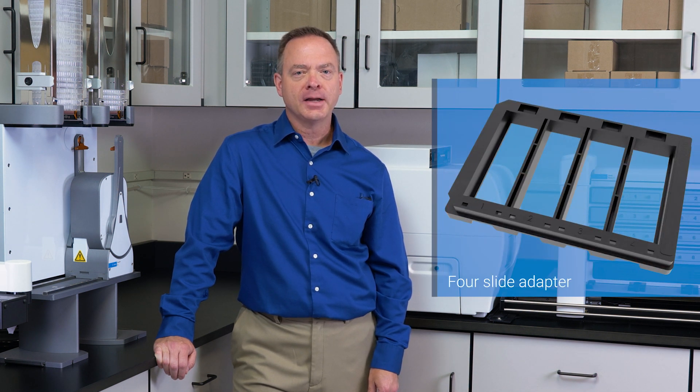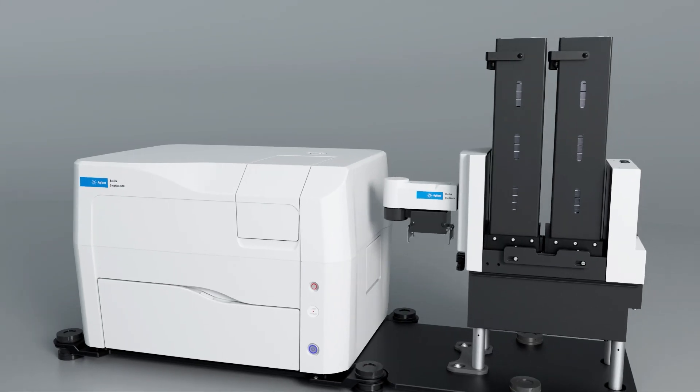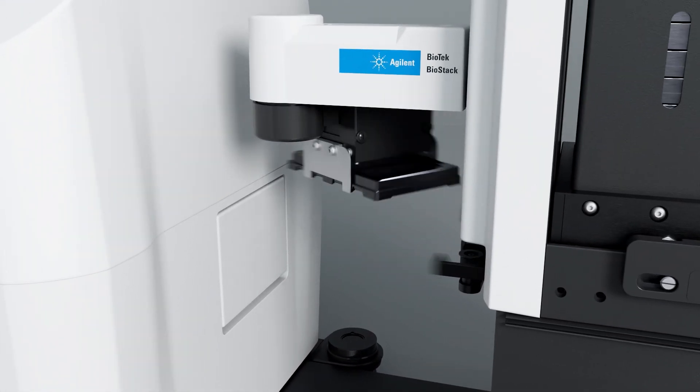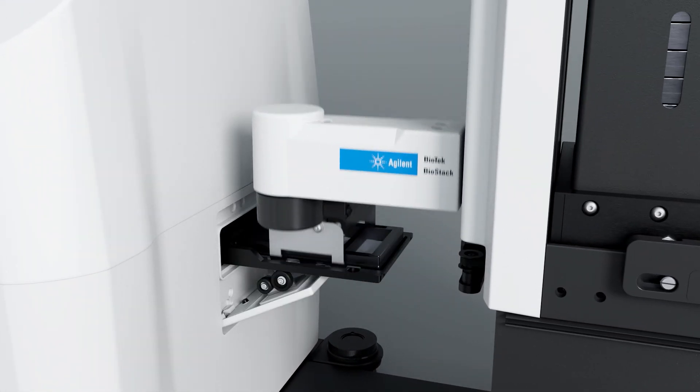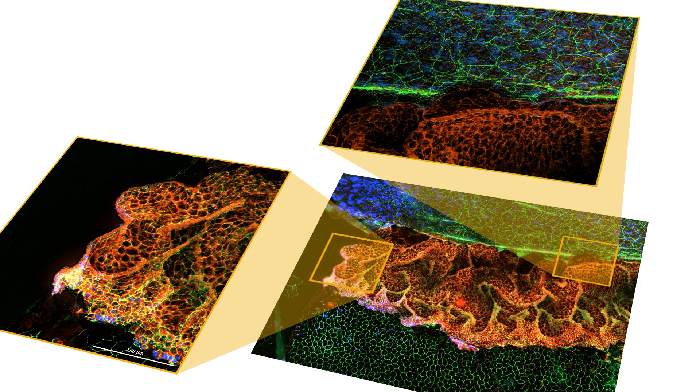Finally, if there is a desire to perform automated slide scanning, Biotech offers a BioStack compatible four-slide adapter. When combined with one of Agilent Biotech's citation cell imaging multimode readers and the automatic region of interest module, the desired areas from each slide can be automatically imaged in a rapid walkaway manner.